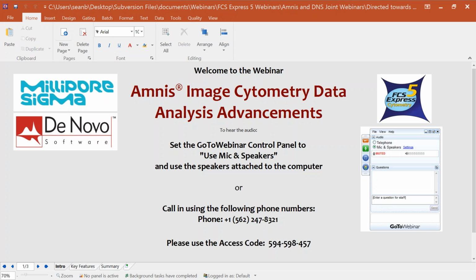Towards the end of the webinar, we'll be explaining and focusing on reporting and batch analysis of Amnis-derived datasets in FCS Express Image Cytometry, where you can link up the raw DAF and CIF files from your Amnis IDEAS software into FCS Express. Later on today, we'll also be hosting another webinar that will be focusing specifically on working with those data sets in FCS Express.